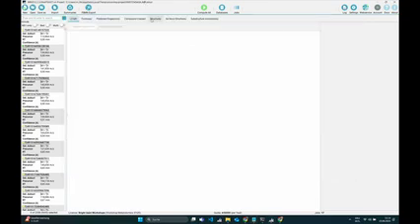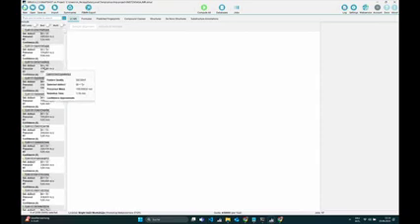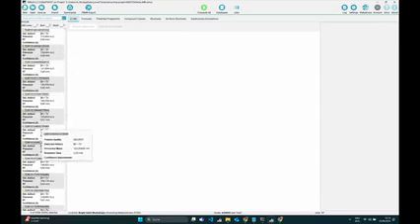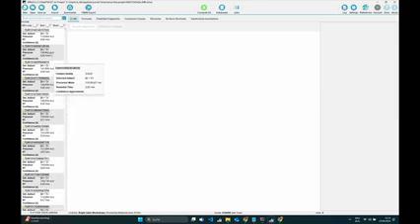So now the preprocessing has finished. Now some stuff has appeared. You can see this in the left side. So here, all our features which have been detected are listed. You can scroll through this list and see it's quite a long list. So although we have just selected 2 of these files, we still have a few thousand features. And this list is even filtered a little bit, because if you just look roughly at it, you can see like each of these is one feature.